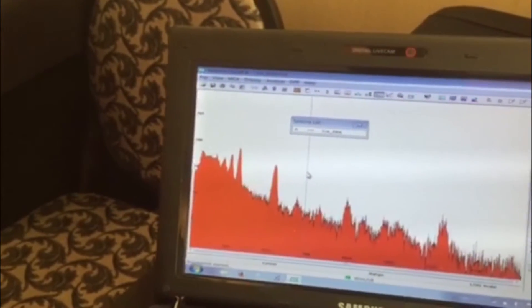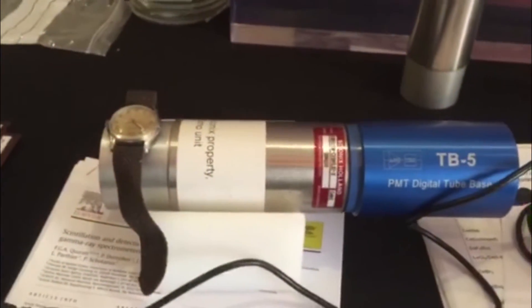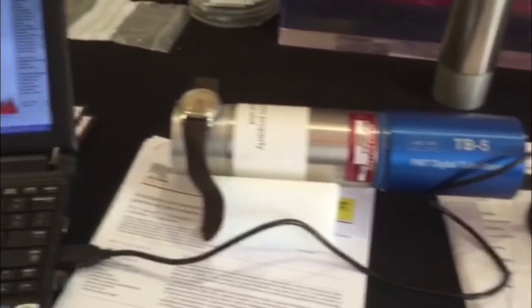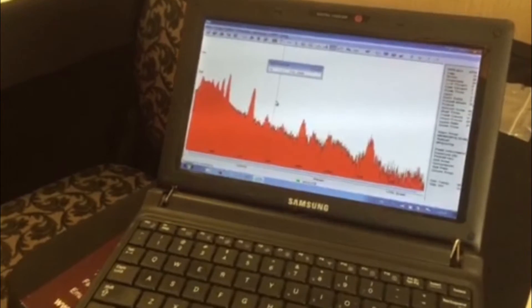The cerium bromide room temperature detector is plugged into an Amtec tube base, connected and powered off USB from a laptop running spectroscopy software.